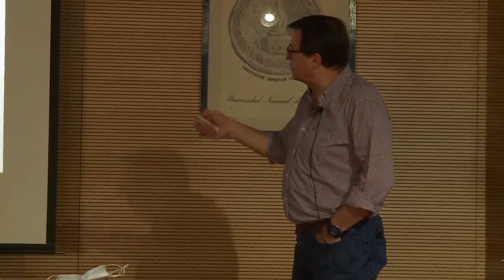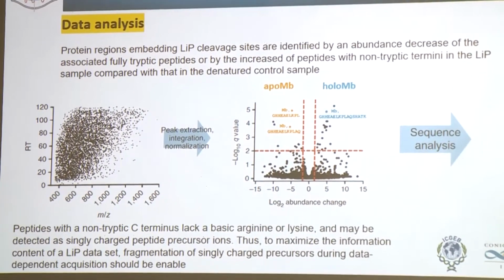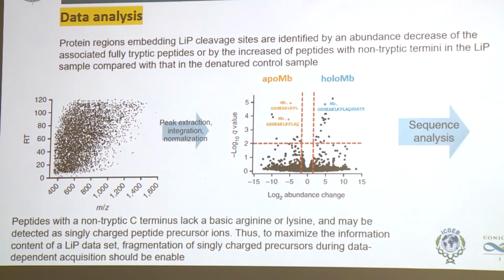Let me go back to something that I mentioned to you. One of the problems is that you will have peptides that are not tryptic peptides.